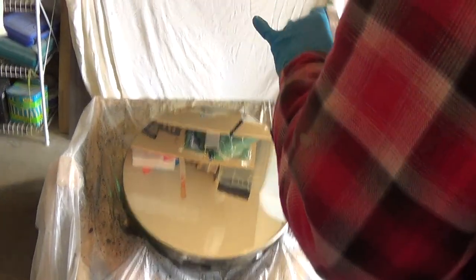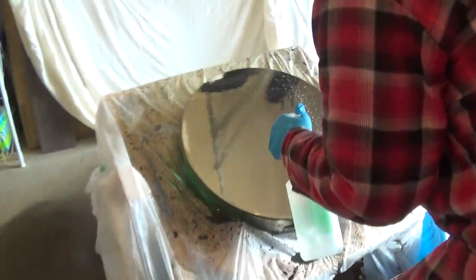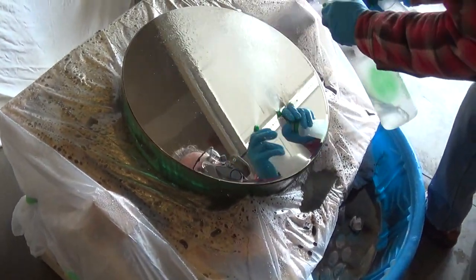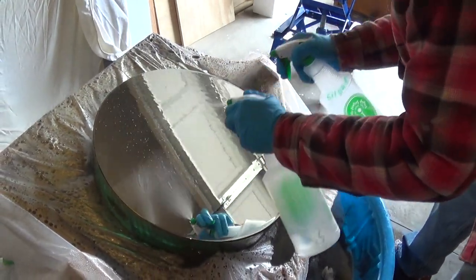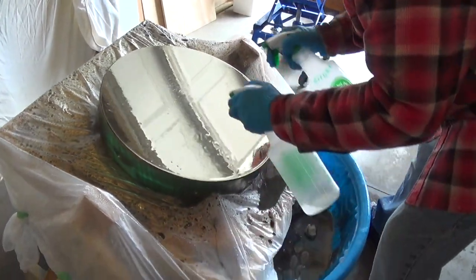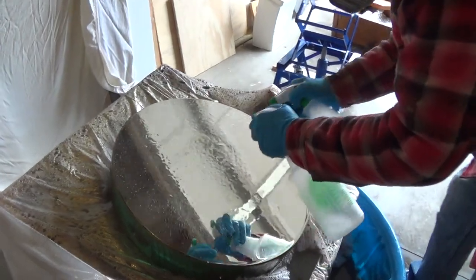I'm going to do it one more time. There we go. I'll do it a little bit too late. That's a beautiful looking surface.